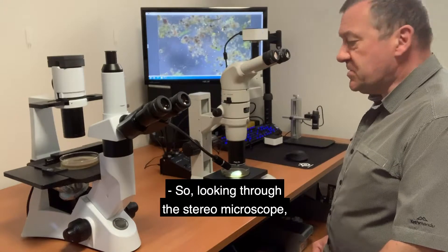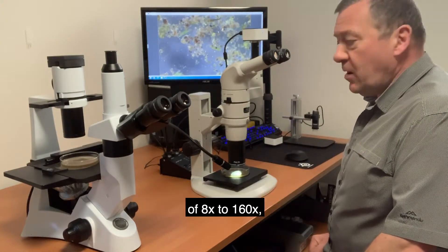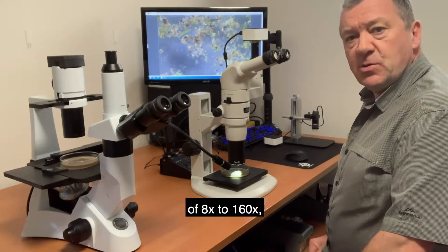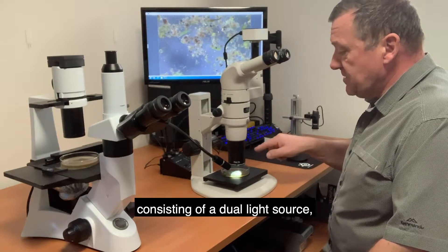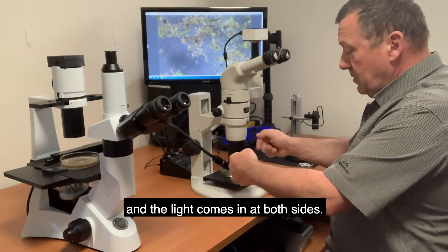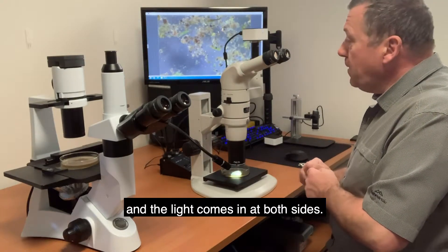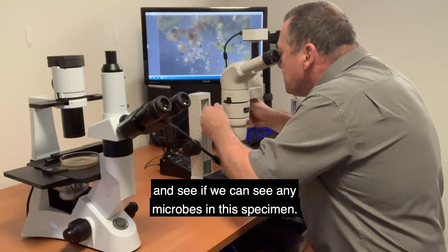Looking through the stereo microscope, this particular microscope has got a magnification power of eight times to 160. We've got the illumination system consisting of a dual light source and the light comes in from both sides. We'll have a look now and see if we can see any microbes in this specimen.